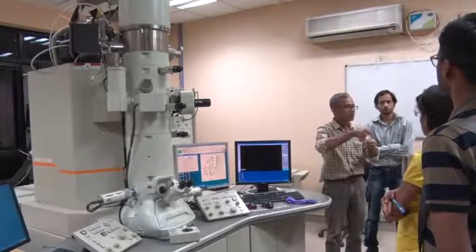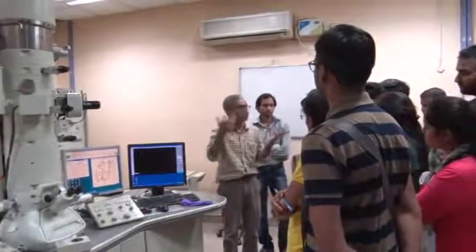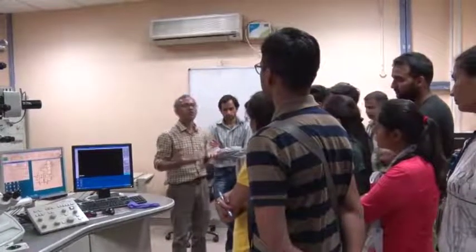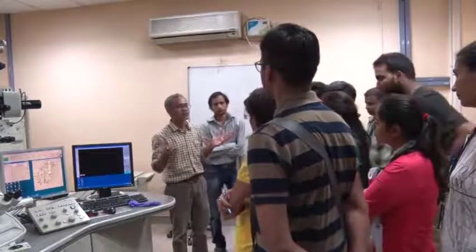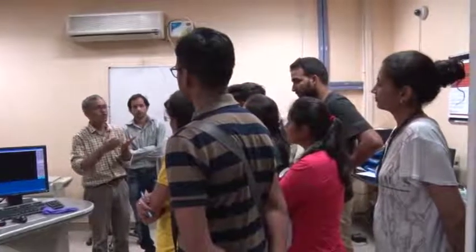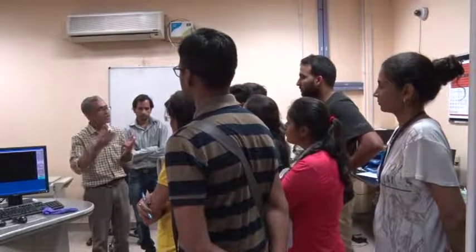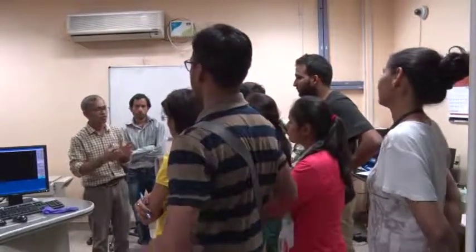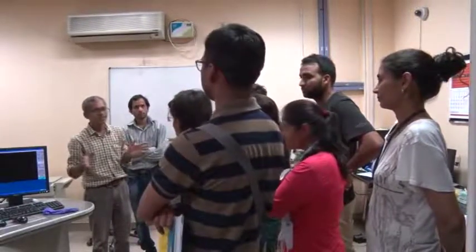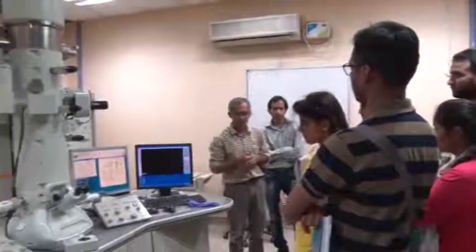Punch a 3 millimeter disc, and put it into the ion milling machine to create a hole at the center. Then we already have the sample ready, and it's cheap, no problem, and one can see most of the microstructure features that one would come across in any typical sample. For example, we will be able to see grain size, grain boundaries, two beam condition, contrast features like bend contours, thickness fringes, precipitates, dislocations. So almost all that one would usually come across in any typical sample is in there, and therefore it is a very convenient sample to learn about microscopy.